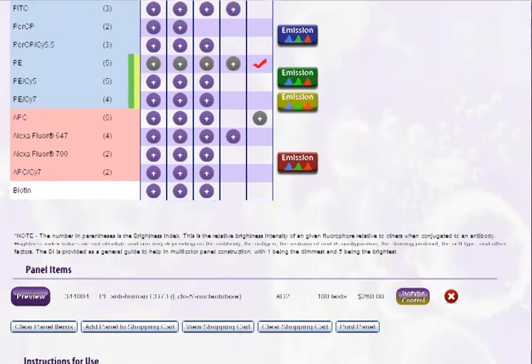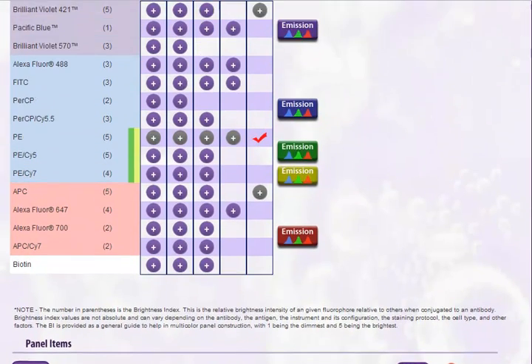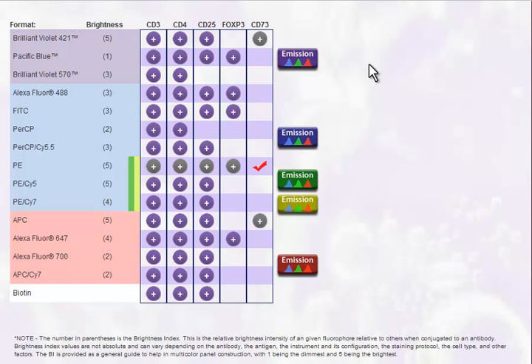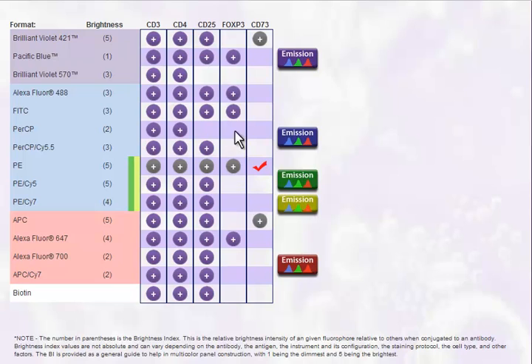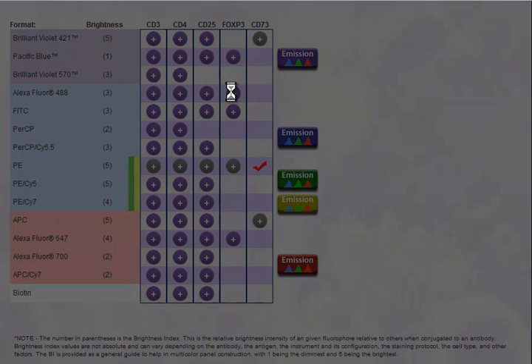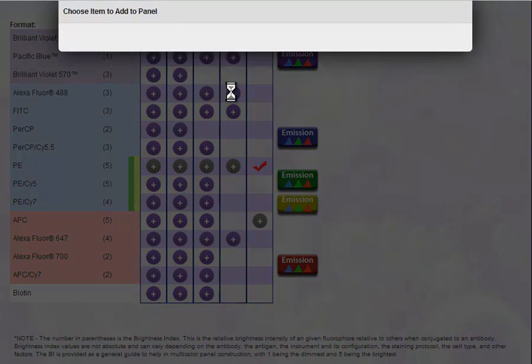Once you have a product selected, the column for that specificity and the format will be grayed out to indicate that these have already been chosen. If for some reason you do wish to select another format of the same specificity or a different specificity with the same format, you can do that. Just select the Grade icon, but warnings will appear to alert you that the same format or specificity has already been chosen.